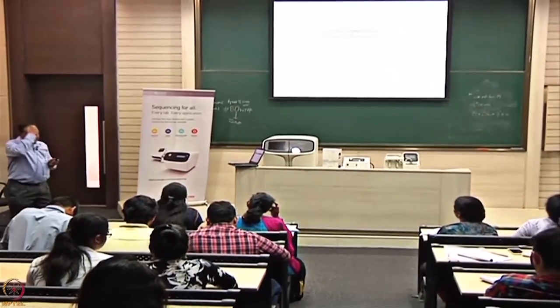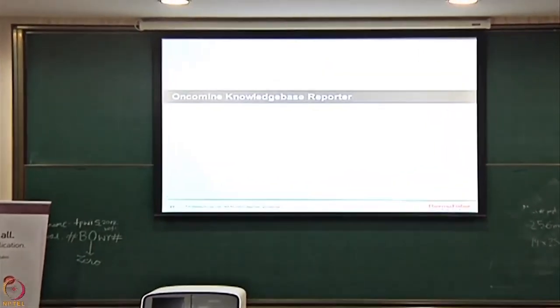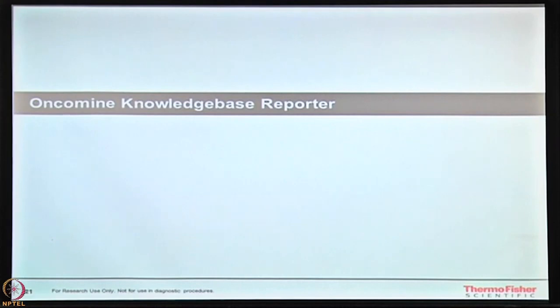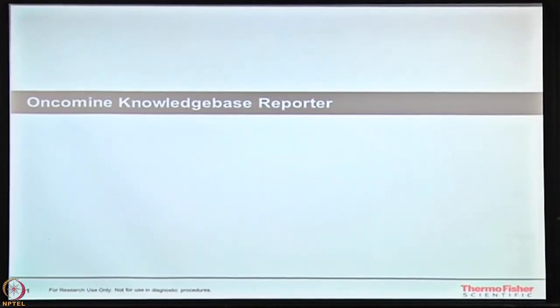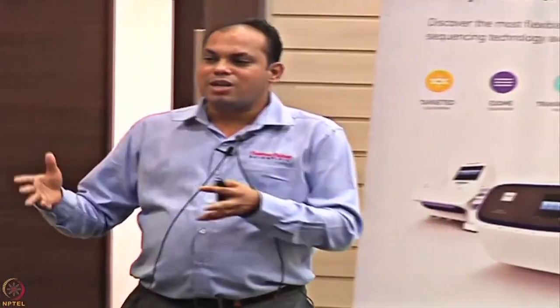At this stage, you have got the idea about the variants, what the variants are that are coming in. But even after doing so much study, what we normally require nowadays is something where the results are very quick. Even if you have got the variants, we need to know their effects and counter effects, and what drugs could be available for such diseases or variants that you are getting. You are correlating your patients' sample information to the variants, getting meaningful information, and then generating information on what type of drugs could be utilized. You have a DrugBank database correlated to this, but doing all the correlations would take some time to get you the results.